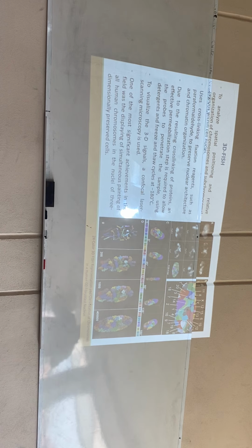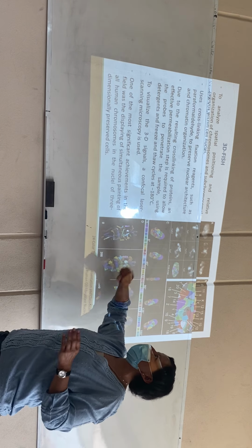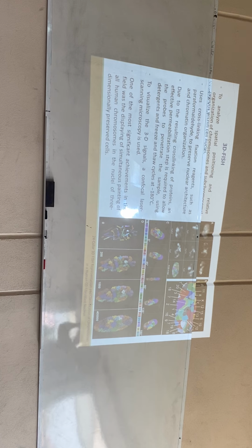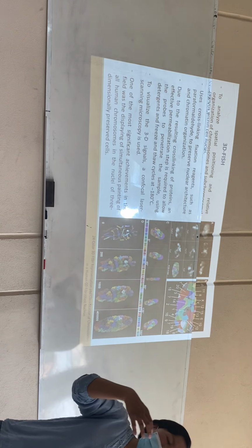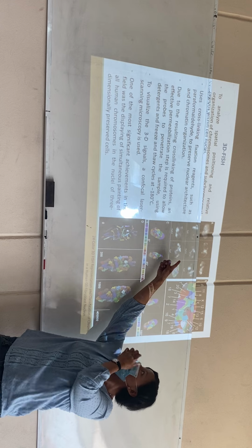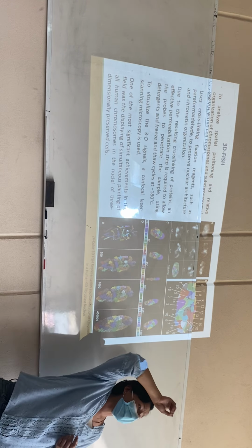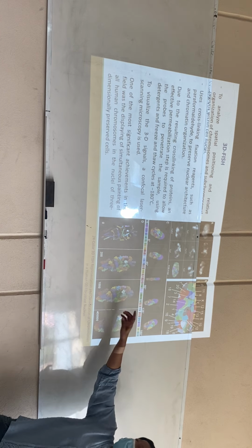You have your sample on a slide. The sample could be a cell. Specifically, this cell, I believe it was in mitosis. And basically, the cell is stained with different probes having different labels. And you're observing that each specific type of chromosome, which is each of these single colors, is representing one chromosome, is labeled with that specific color.